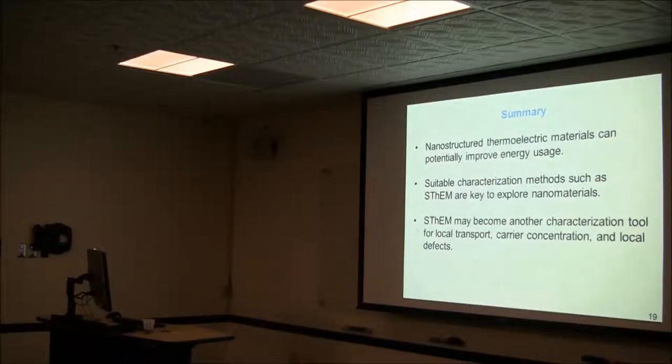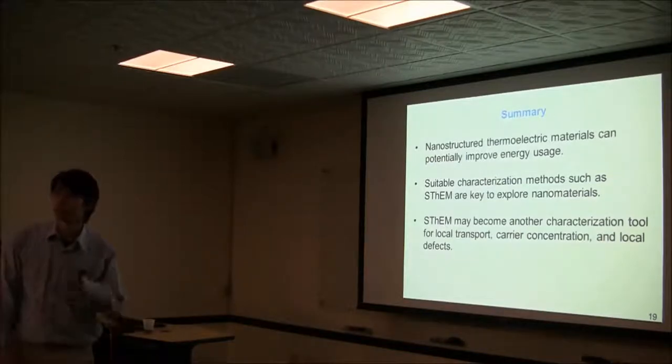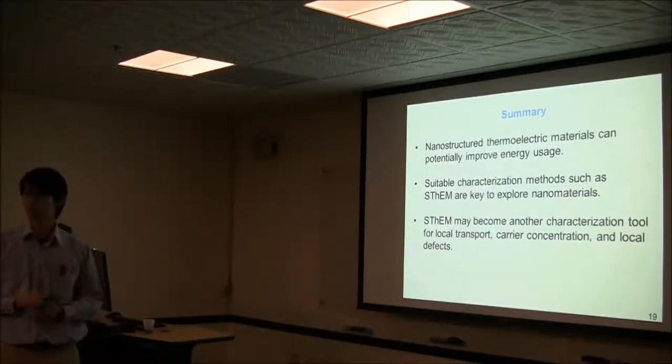Going off of that, what would be really cool is, in these setups you were heating the sample. You could also cool the same side and see that you get the negative voltage to prove that you're seeing this effect, right? Because it works in reverse. It would be cool to see both effects. Then you could just put your sample on a cryostat, and it would be really easy to cool it. That's just an idea.